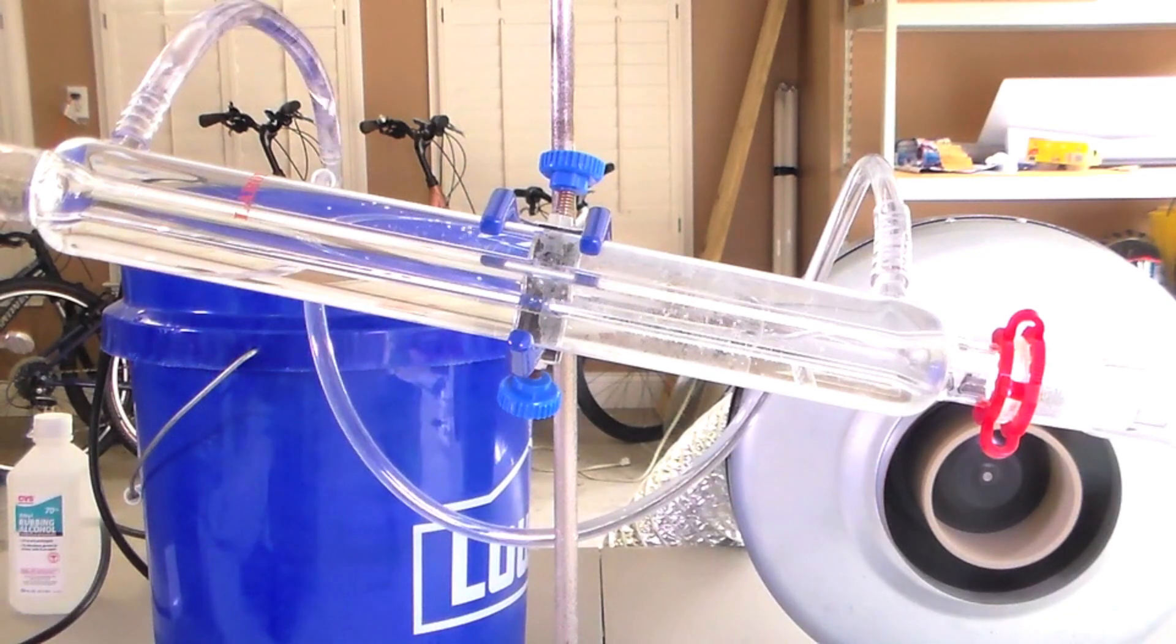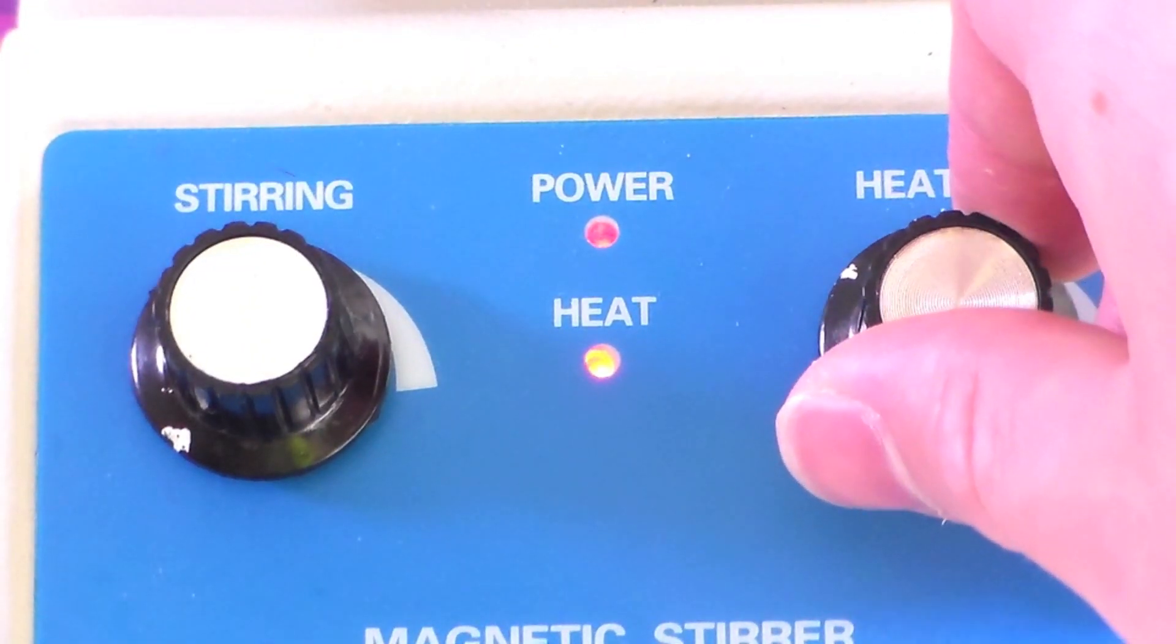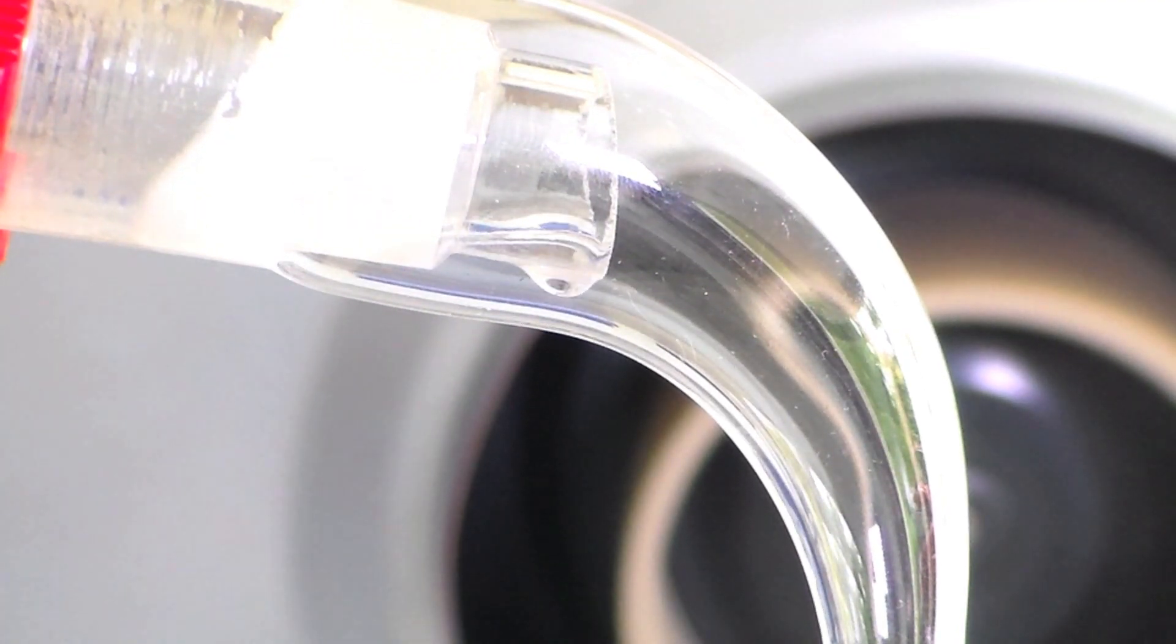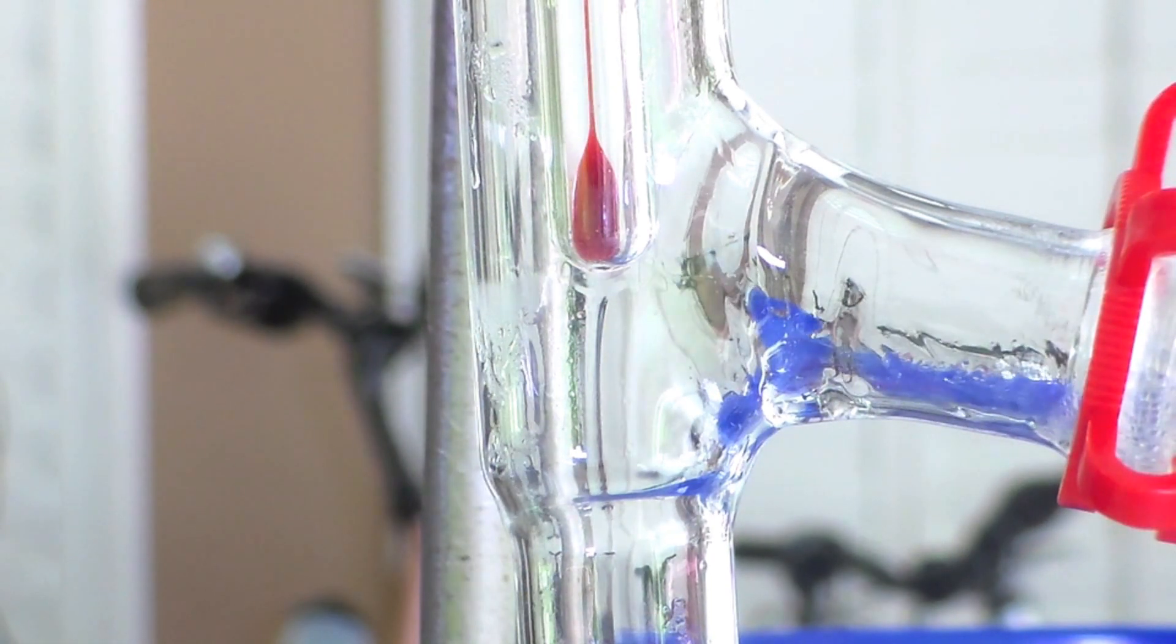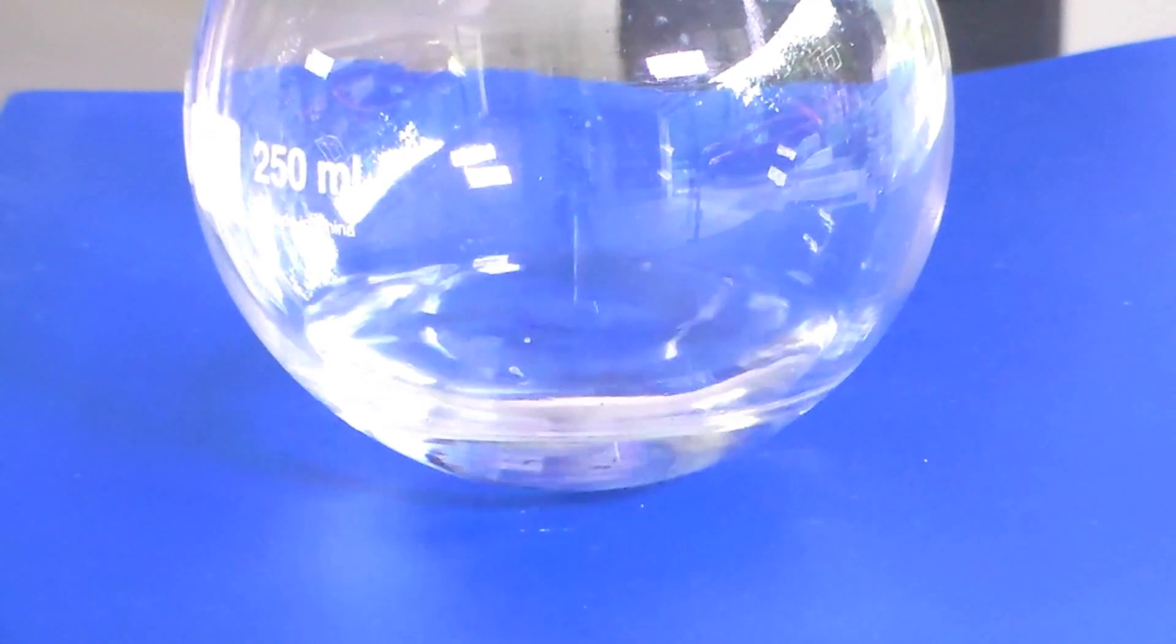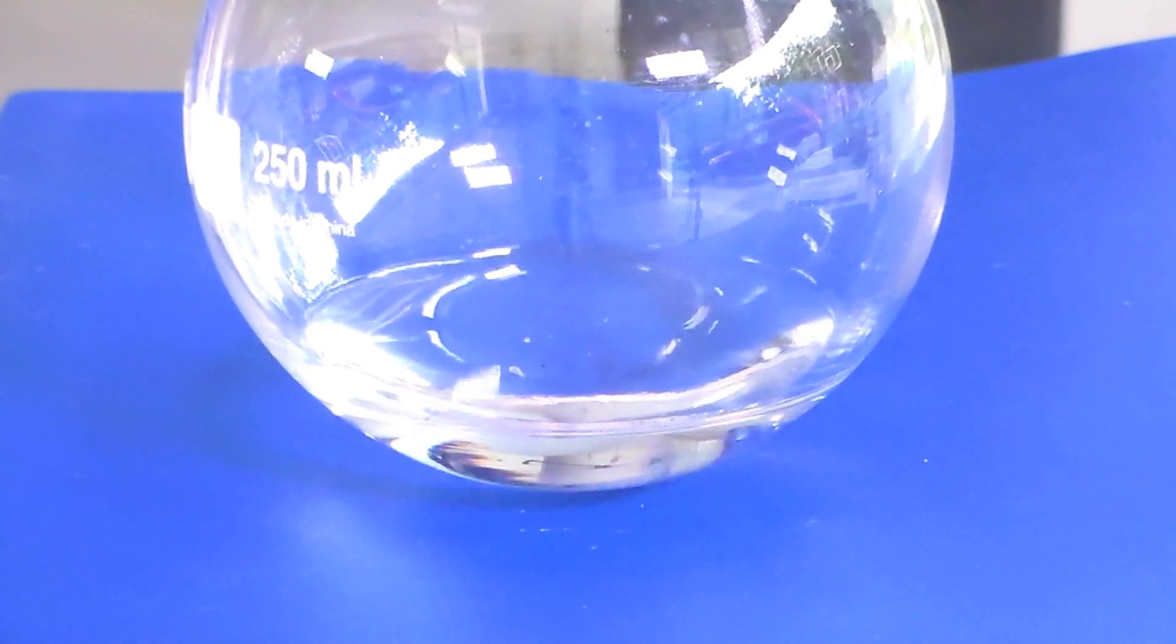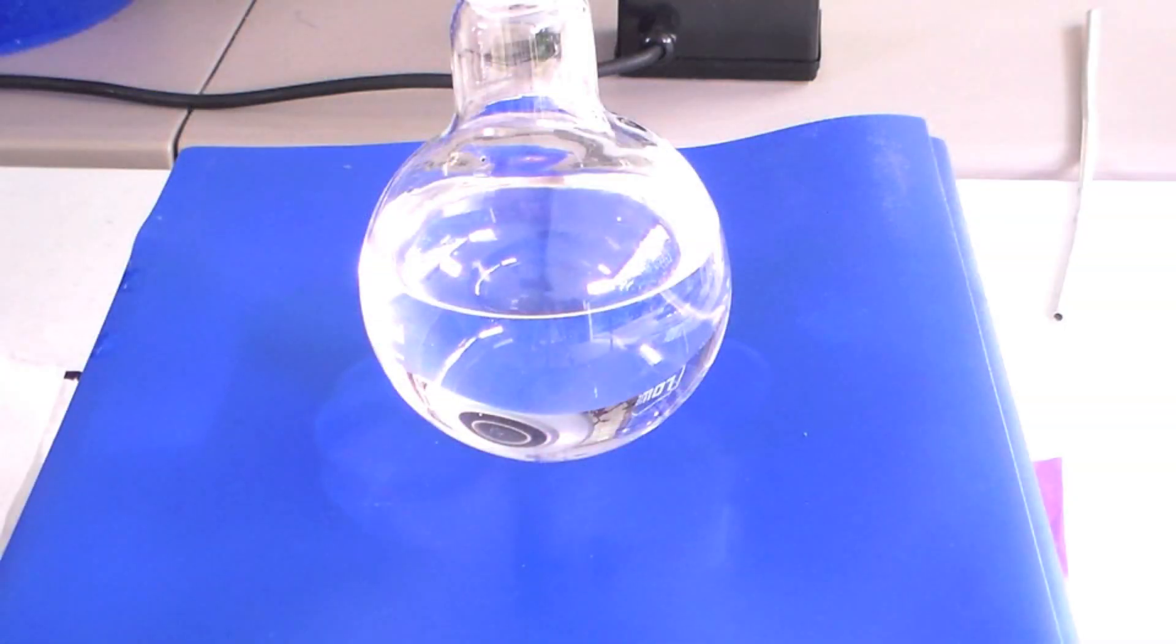Heat the flask until liquid begins to distill over at 78.2 degrees Celsius. This will be a mixture of primarily the ethanol and water azeotrope, but it will also contain the trace amounts of acetone present.